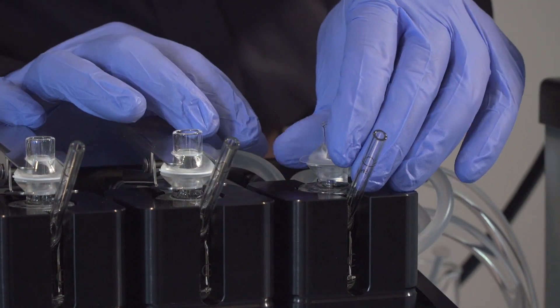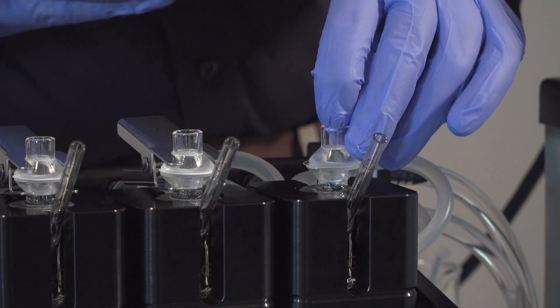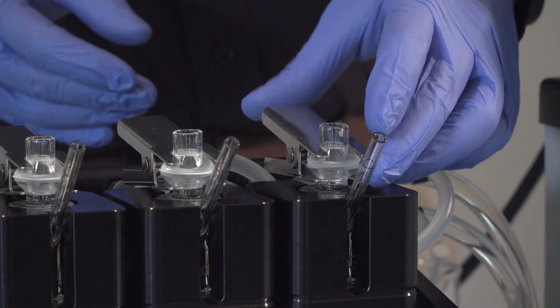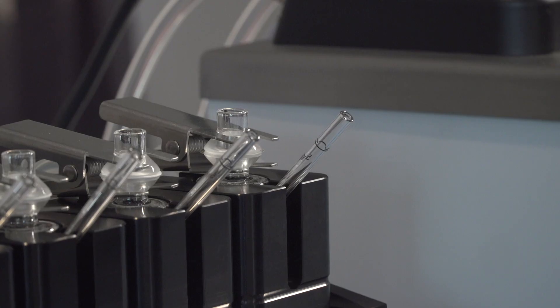For permeation testing, membranes are typically human or porcine skin. They can also be a skin substitute such as Strat-M or Permeapad. For release testing, the use of various membrane filters is common.